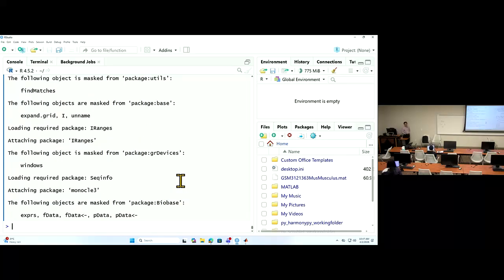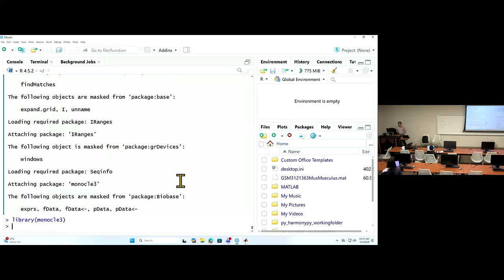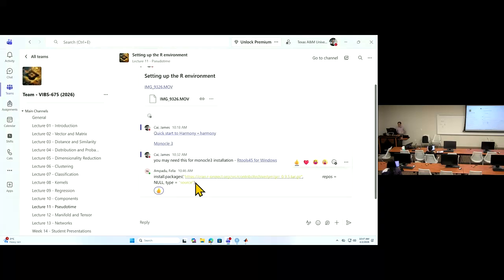And so, indeed, after this library installed, I just missed that. I don't know how you figured it out. Yeah. Okay. It's good. So all you need to do is just copy this, so we can install GRR, a particular version, from an archive, basically. It's before it has been removed, so we still keep using it for some of the functions. Hopefully, we're okay.